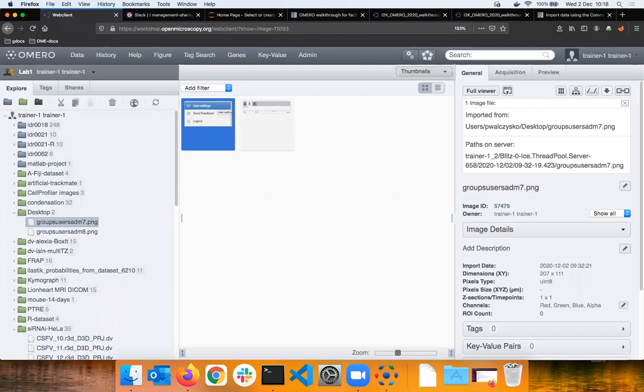Yeah, maybe one more thing. Sorry, there's a question. Could you show again how to in-place import? Is this only done from the web or also in the client? Okay, so this is no and no. I never showed you how to do an in-place import. I did not do it. I just showed you a short schema. So the question, can you again show how to in-place import? Maybe no, because I never showed it.